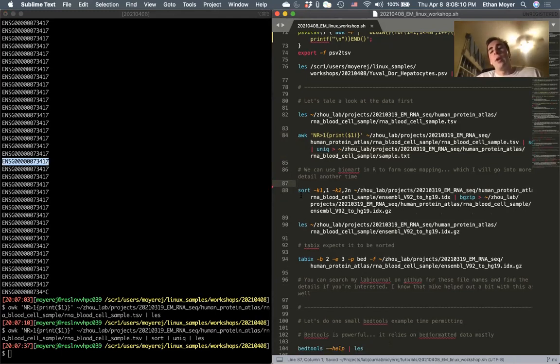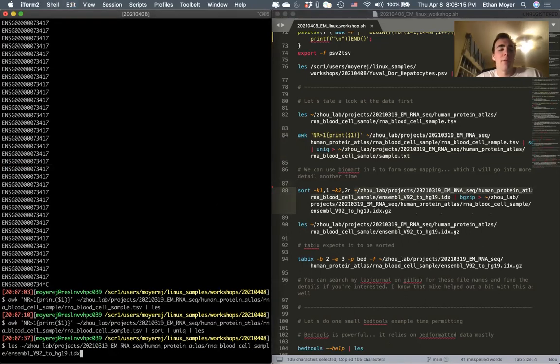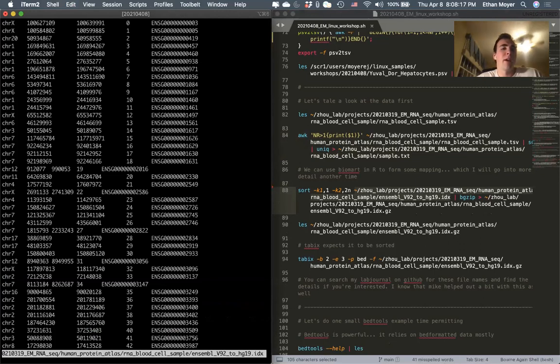This is the output that we get from that R code that I'm not showing. All of these are in the same order in which we sent them in. Like we started with 3 and they were ascending. It maps that Ensembl ID to its genomic coordinate, and then it records the line that this ID appears on. So we know that this was the first row, or 0th position. This is the second row, or first position.